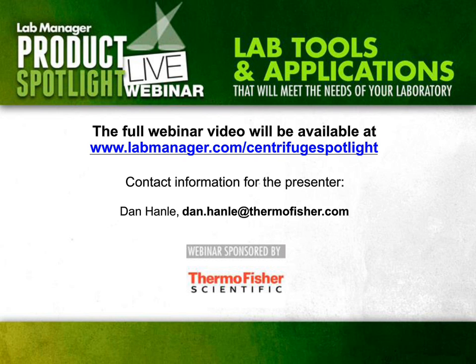So I think we're getting to a point where there are more and more options for the end user when they talk it through. But I would still say, like I said in that earlier chart, if you really want high-end performance, super speed or ultra, or you want to go to 6 liters and up, you're going to be driven towards a floor model. Other than that, you can probably look at benchtop for a lot of the applications that normally would have been done in a floor model before.